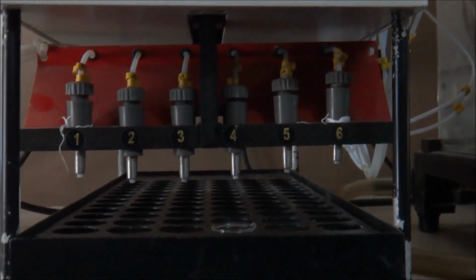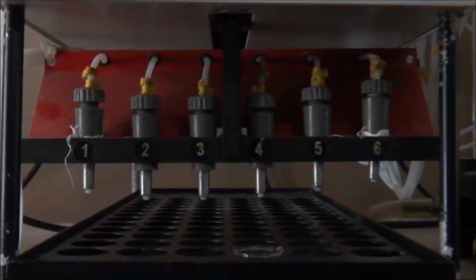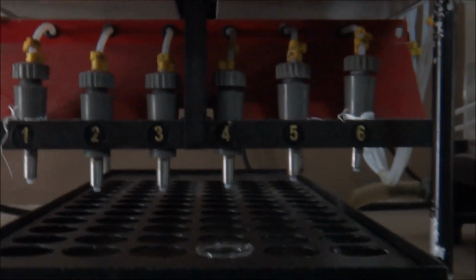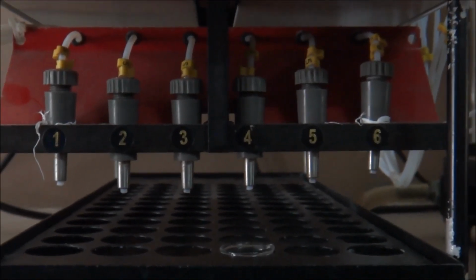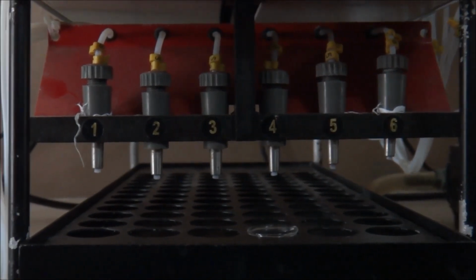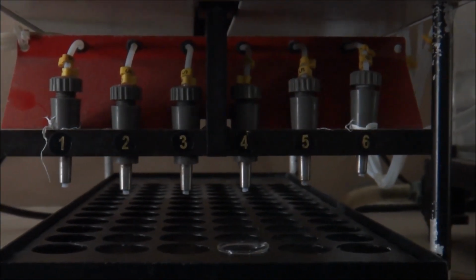It gives a beep sound when it is going to collect the sample, and we can also see the pump getting automatically switched on. So we can now expect a beep sound. Yes. So the pump is ready and it is sucking the sample.